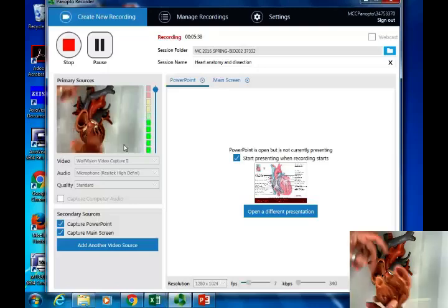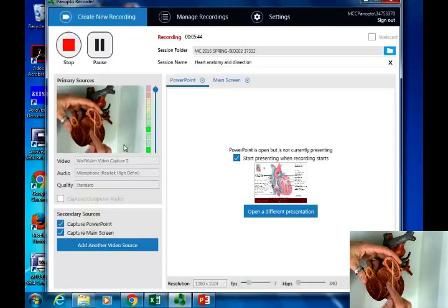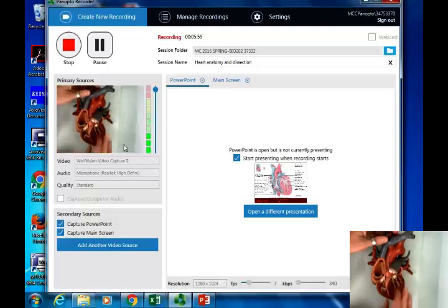Remember, we also have those muscular ridges. We have the trabeculae carneae down here in the ventricles. We also have these ridges in the atria, which are going to be the pectinate muscles. Okay, so those are usually better seen when we look at the, if you will, the front cover like that. There are some specialized things that we are identifying there as well.